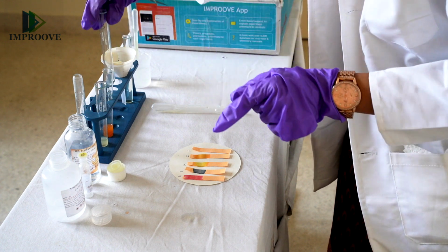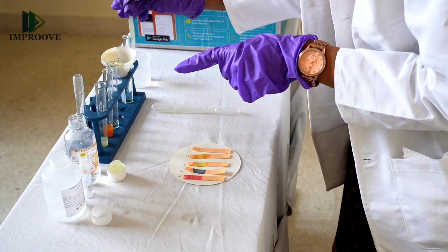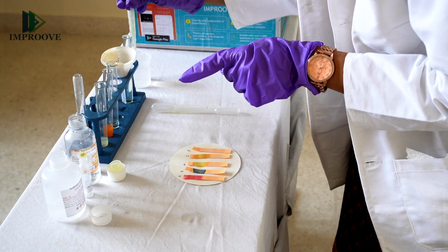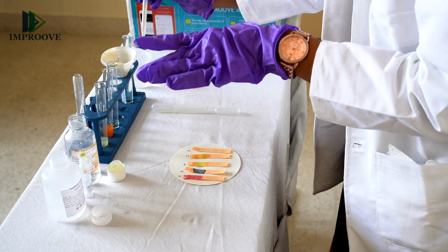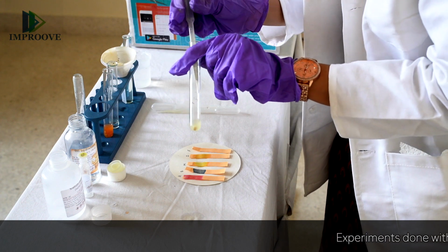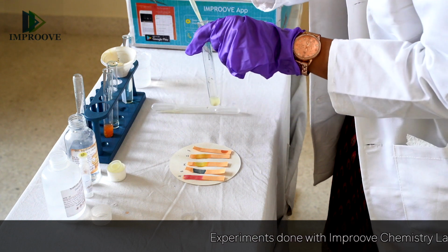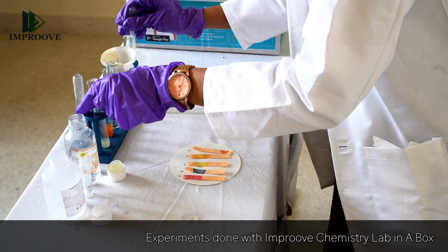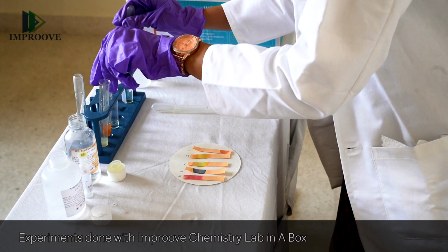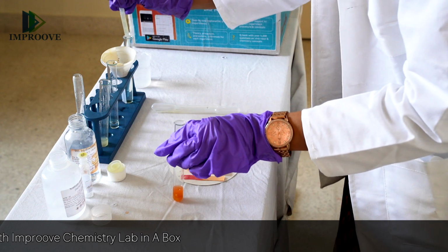And the last one, since we have both lemon juice and tomato juice, on either side of the pH strip you can drop about a drop each from the 2 test tubes. So this is the color change for lemon juice, and on the other side we will drop some tomato juice.